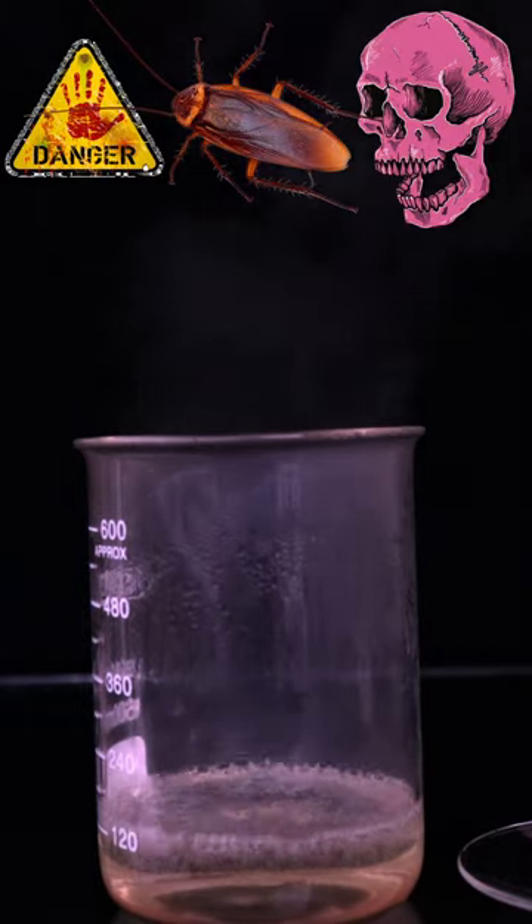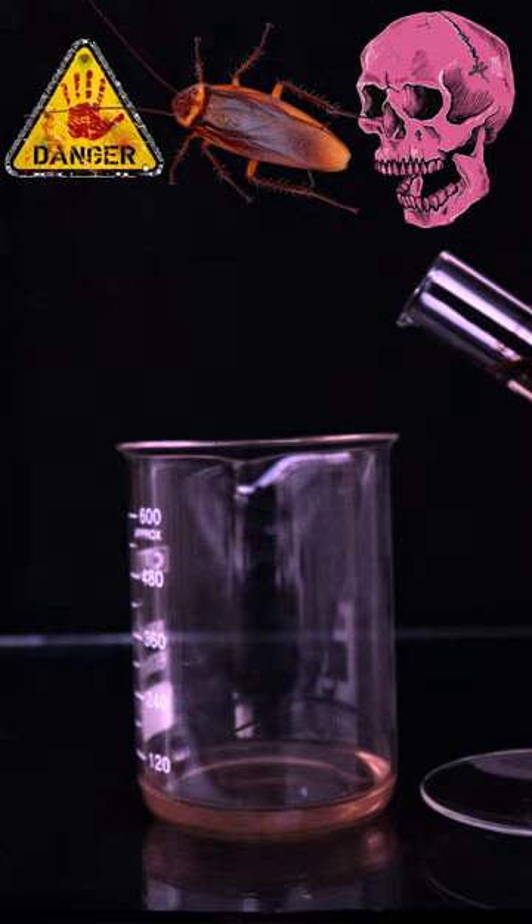This is piranha solution, the most dangerous chemical we can make in the lab. It's made by mixing concentrated sulfuric acid with 30% hydrogen peroxide.